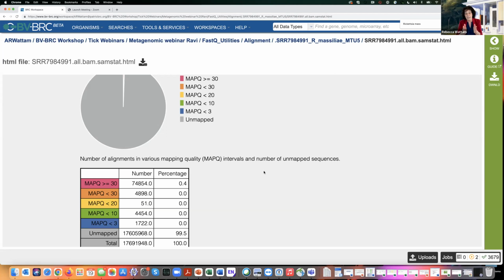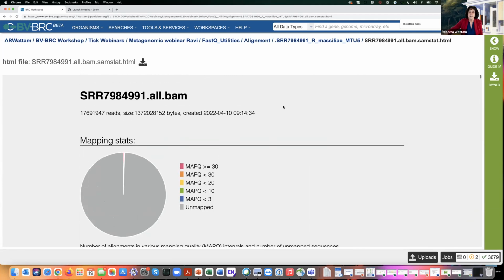Remember, the taxonomic classification is just based on K-mer signatures, which are small pieces of DNA that are unique to certain genomes. And it wouldn't be outside the realm that an adapter sequence could align to a Staphylococcus genome. Okay, so these are from the straight up reads.